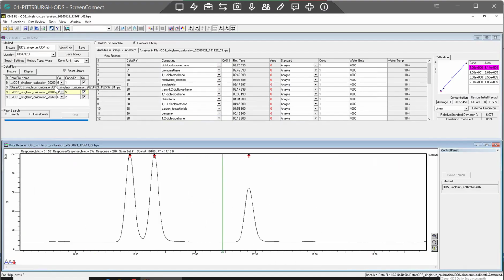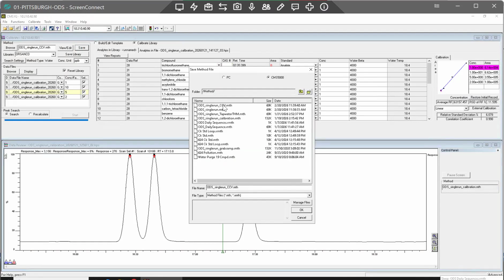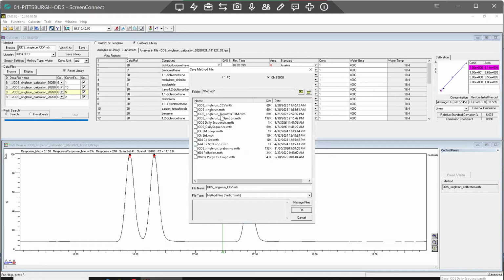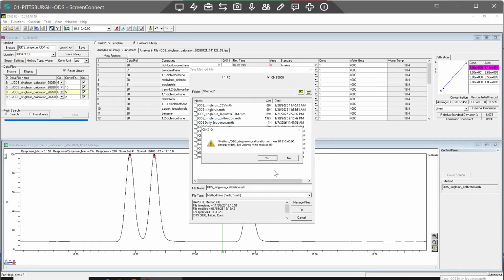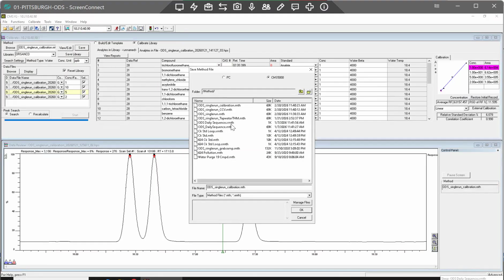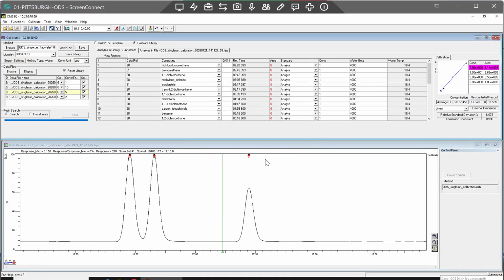So I think if I can, I can just save it to each of those. I don't know if that actually saved before, but we're just going to say yes. Oh, I guess I already did that. And then we're going to try the other one, which is our calibration file, which I don't know if you have to calibrate the calibration file, but whatever. So we'll say yes. Which other one? Tap water. Oh, yeah. We did create a tap water for THMs on this one.